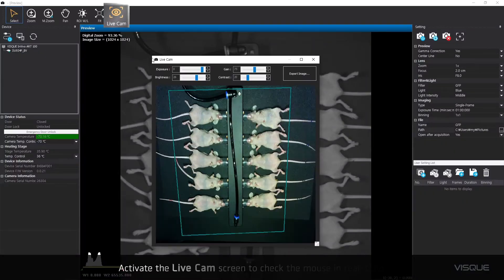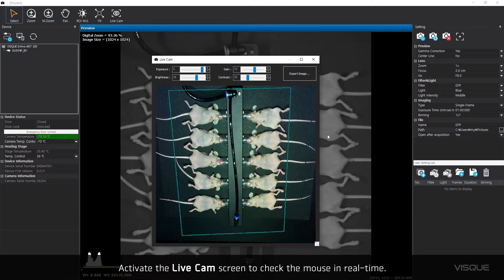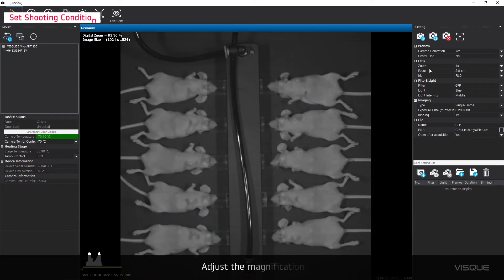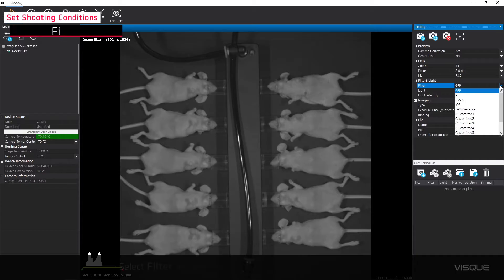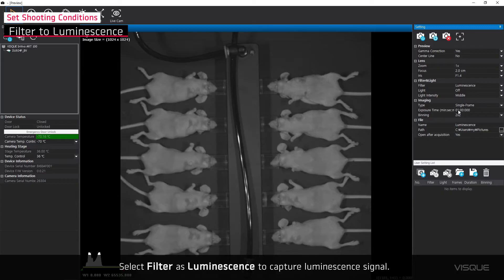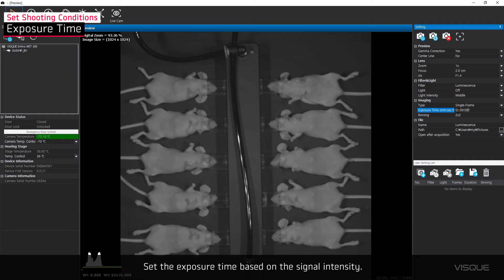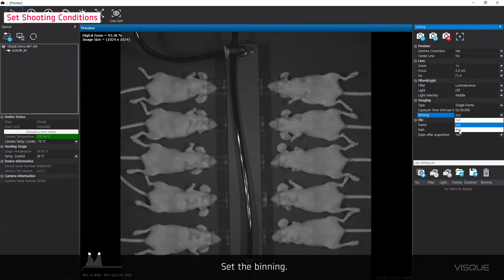Activate the Live Cam screen to check the mouse in real time. Adjust the magnification. Select Filter as Luminescence to capture the luminescent signal. Set the exposure time based on the signal intensity. Set the binning.